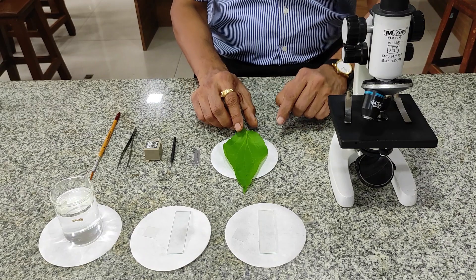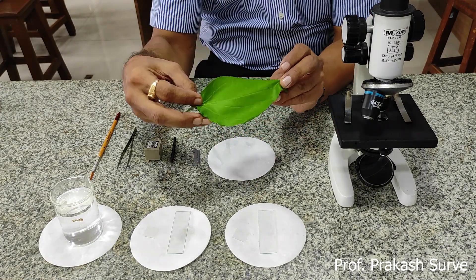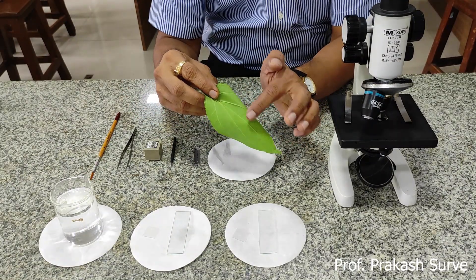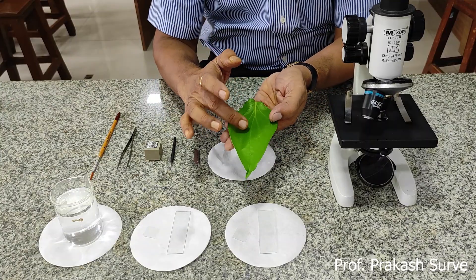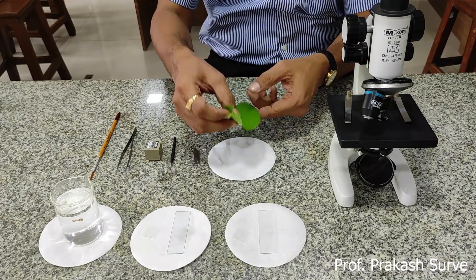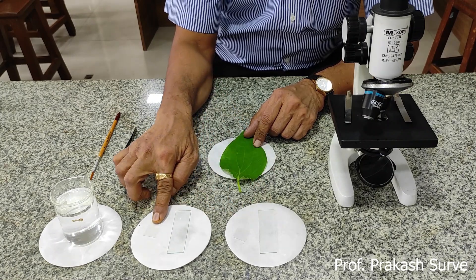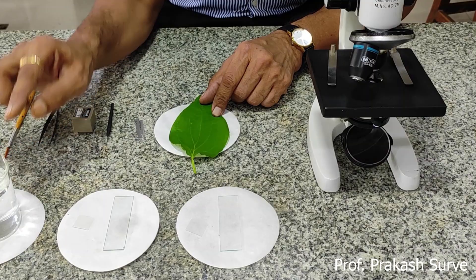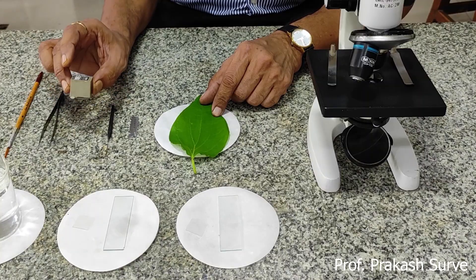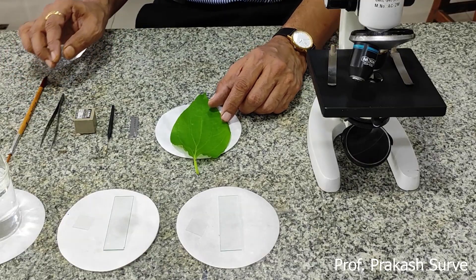In this experiment we need a beetle leaf of medium size. This is a dicotyledonous leaf. On the upper side we find a darker color and on the lower side a lighter color, so on the upper surface we find very few stomata and on the lower side we see the maximum number of stomata. We also require one slide, one cover slip, another slide, another cover slip, water or glycerin, forcep, blade, needle, and a brush.